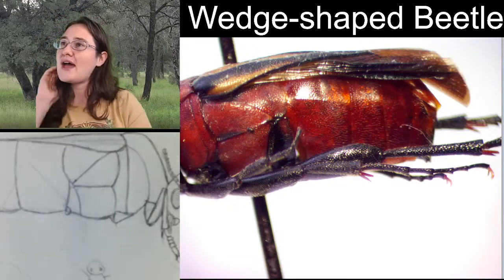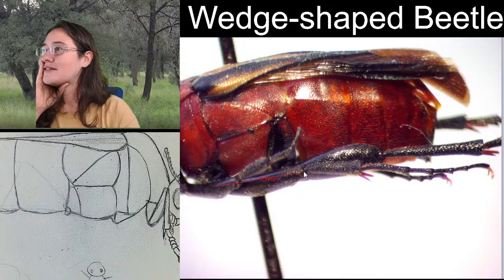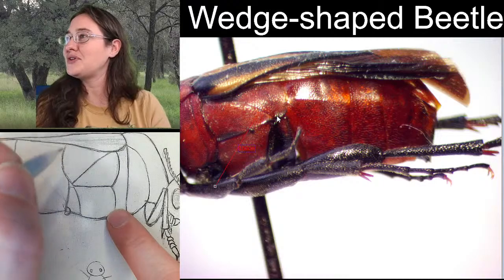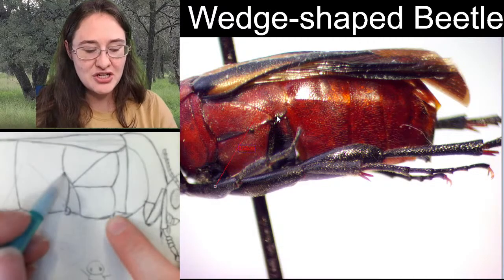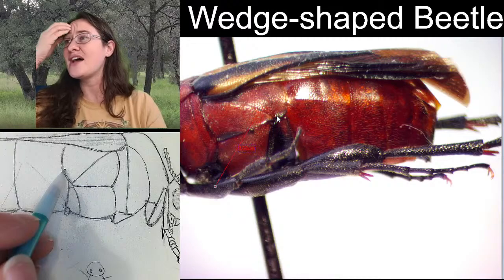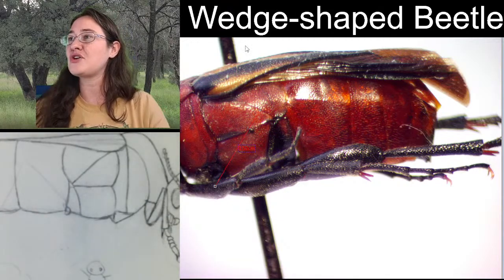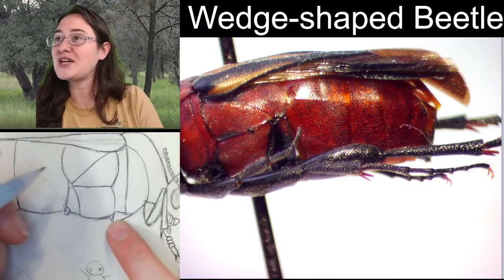If we imagine this femur here, I'm going to cheat. That is 0.51. It's about here. So it's going to be coming up to right around here. Our middle leg should come up right around here where this arches. That's going to be the correct ratio. We are a little bit zoomed in, so if you see that measurement there, the measurement is not correct. But the ratio is, right?